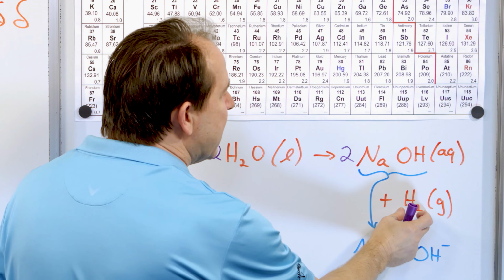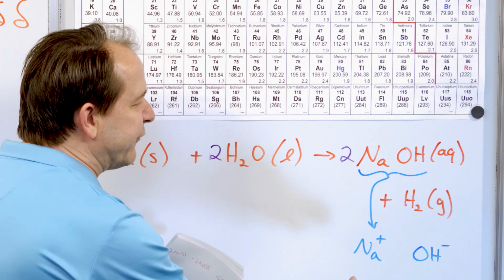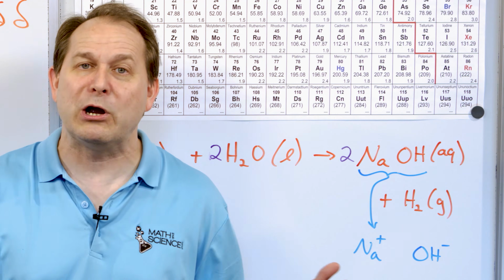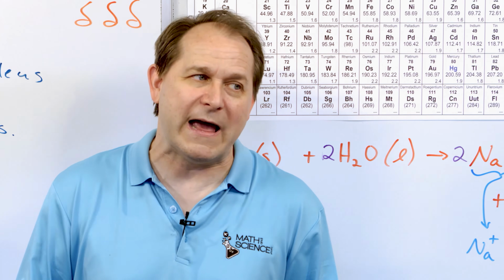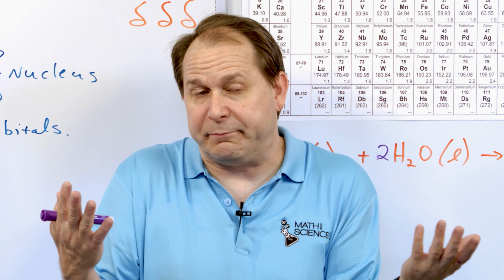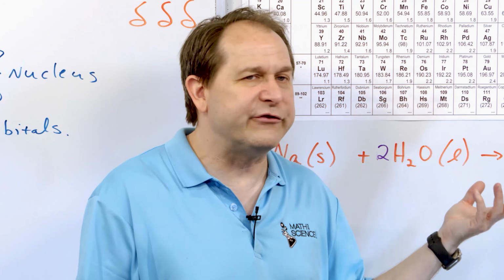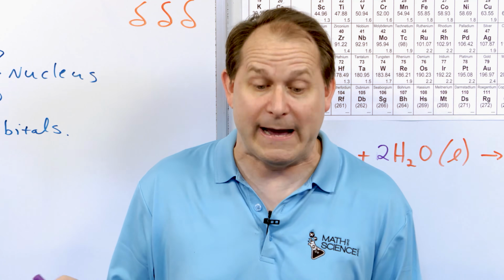The hydrogen, as we've described, comes together and makes H2, but what I haven't shown in this reaction is that this H2 gets hot enough to combust. If you do this experiment in a vacuum chamber where there's no oxygen in the outside environment, which I think I will do one day, then the reaction happens. The sodium, I expect, would get molten and do all the stuff, but the combustion wouldn't happen because there's no oxygen for this thing to burn with. I'll do it one day and we'll see, but that's what should happen.